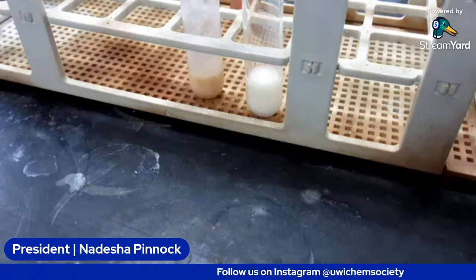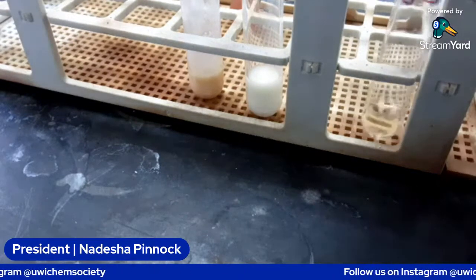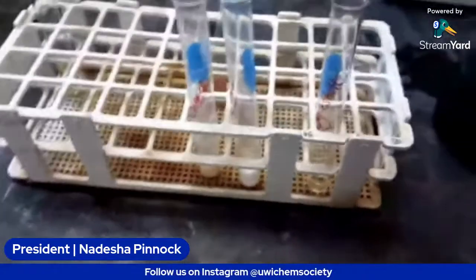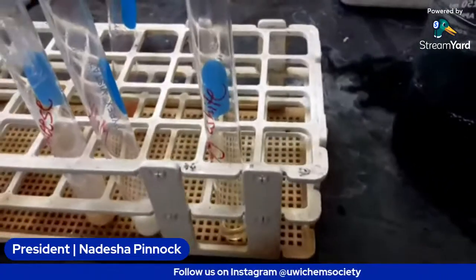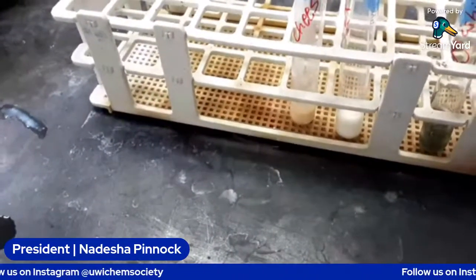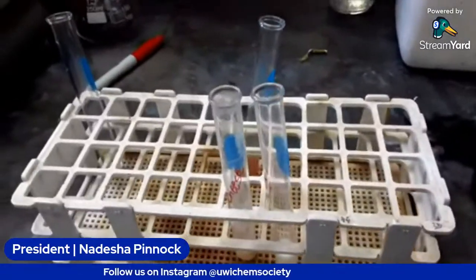All right, so guys, we also have egg white with us, or albumin. So we're also going to do a test with that. So we are adding about 1 to 2 mL. I'm going to give it a little stir. We're going to add 1 mL to the egg white just because it's not a lot. We're going to shake it.